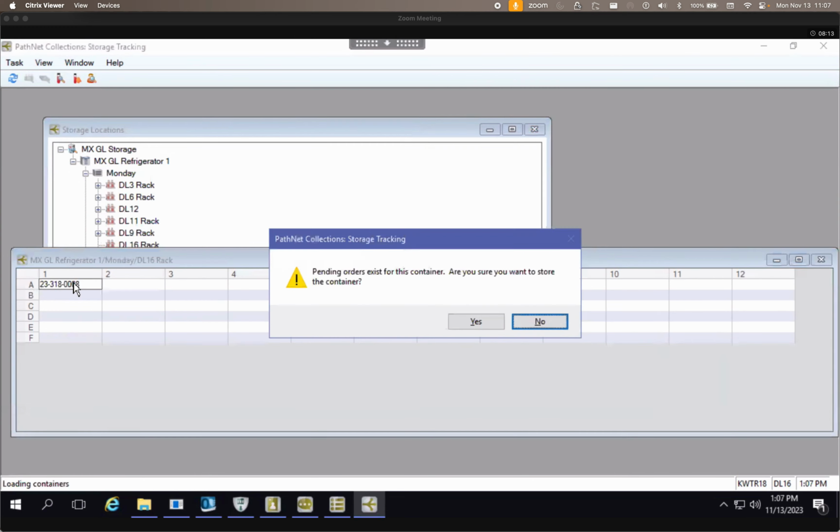And remember that there's only one container on that accession. So it'd be your accession number. Usually we would put an A, B, C, or D at the end. There's only one container, so it's going to default in A4s.